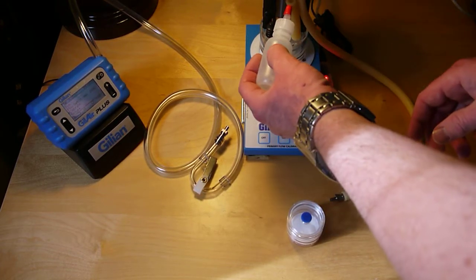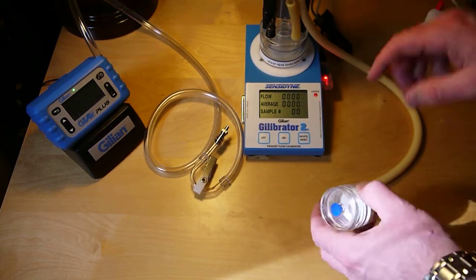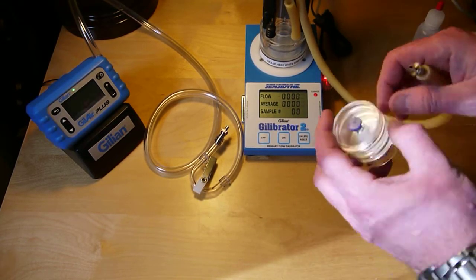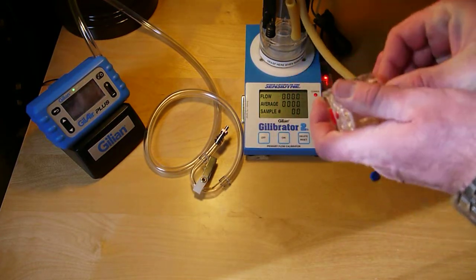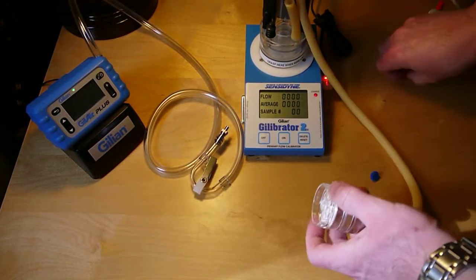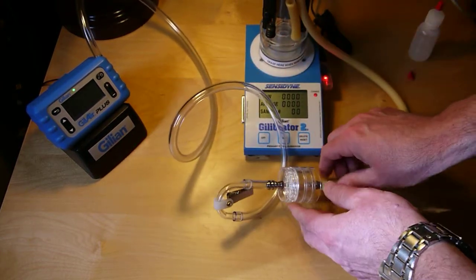You'd add the soapy solution through this tube. To connect up the filter cassette, this is the inlet side here connected to the Gillibrator.